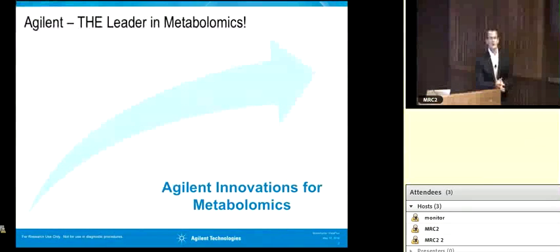So after you've referenced METLIN and you have all of your identifiers present and everything, and you've built your metabolite list, the last thing to do is really to select your tracer. And as you've already heard, this can be accomplished in many different ways. You may try different tracers to probe different entry points on a pathway. And so, for example, if you're going to probe glycolysis, you're likely going to start with fully labeled C13 glucose and watch it perfuse through the pathway gradually over time.